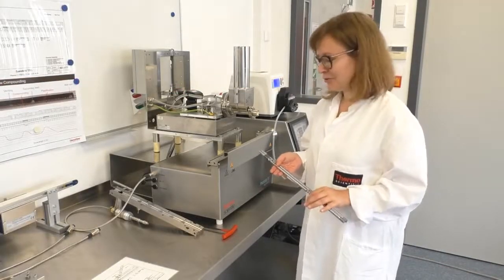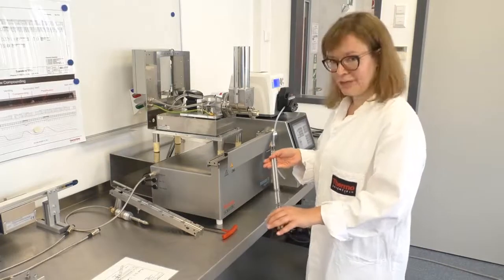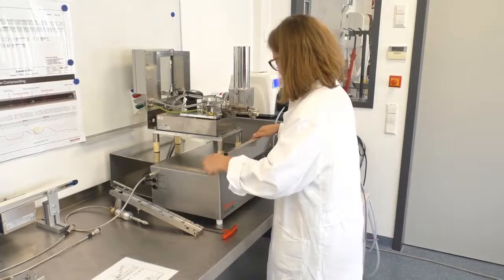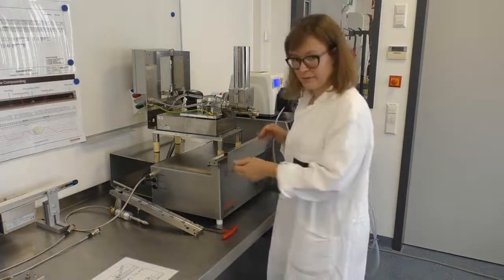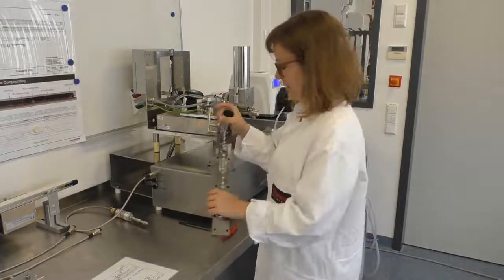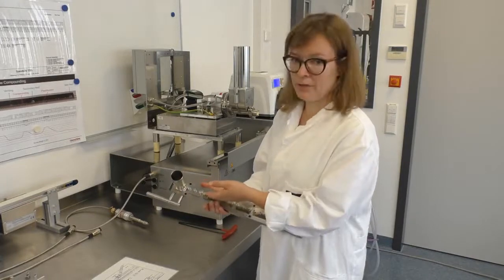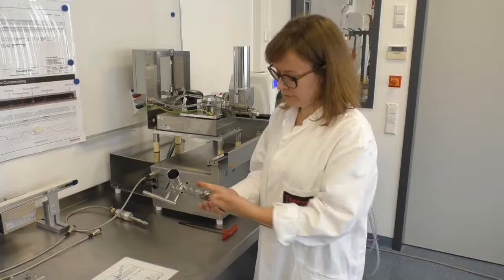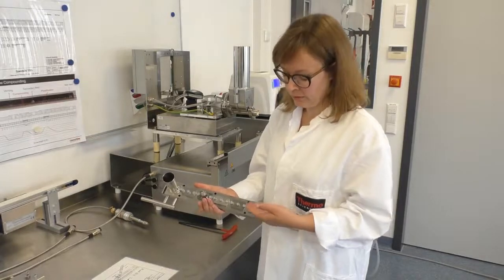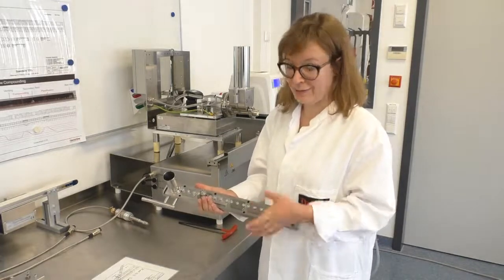Now I want to show you how we assemble all these parts together, and then we will start with the process itself. First of all, I place these two co-rotating screws into the extruder barrel. Like this. Then as the next step, I place the upper barrel part, which has the feed intake part here at the beginning and the liquid feeding port in the third part of the barrel. As you can see, we have a fully ported barrel design, which means that at a later stage of your process you could also install another liquid feeding port, for example, for feeding oil or colors or whatever you can think of.